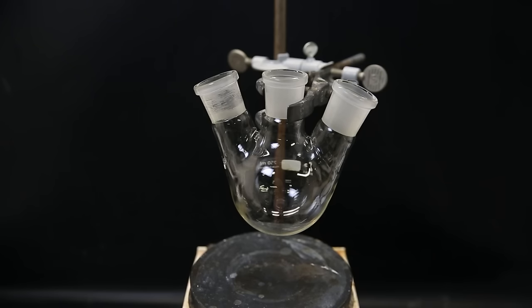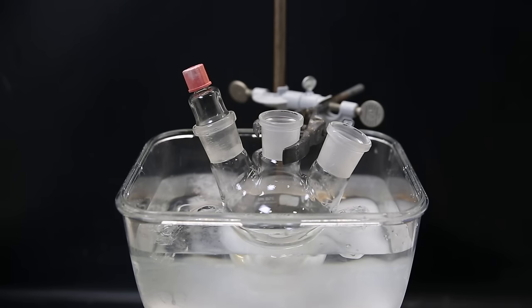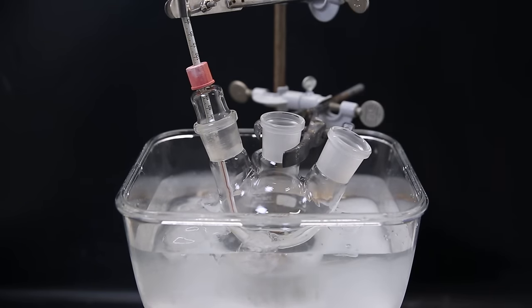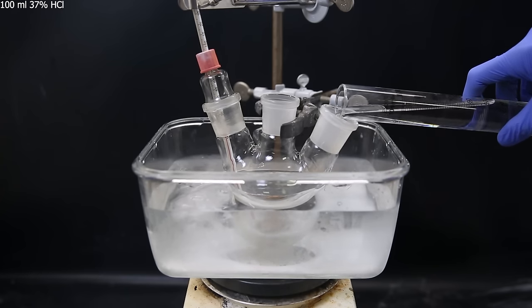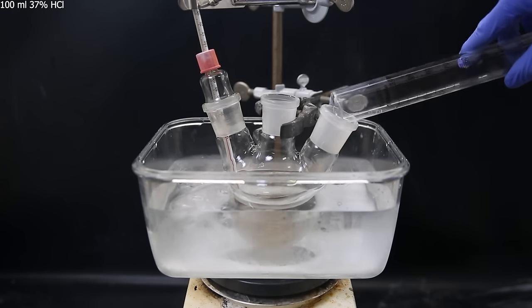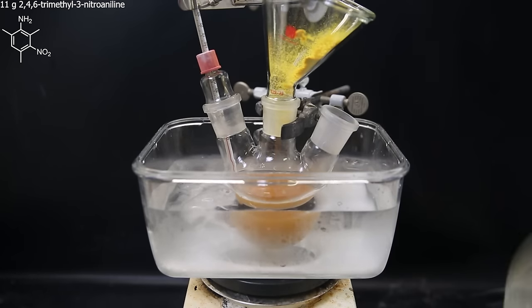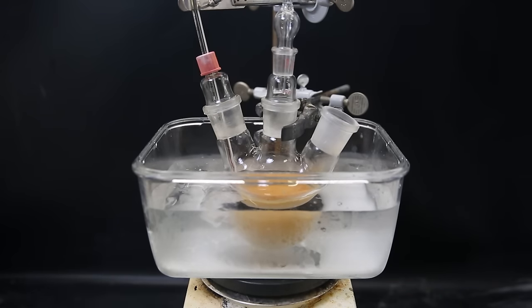I again set up a stir plate and a flask, and attach a thermometer adapter, and submerge it in an ice salt water bath. I add in a stir bar, and dip in a thermometer. Then I start cooling down 100 mL of 37% hydrochloric acid by pouring it into the flask. I then attach a funnel, and add in all of the nitrated product I just made. I replace the funnel with a small dropping funnel, and stopper the other neck.